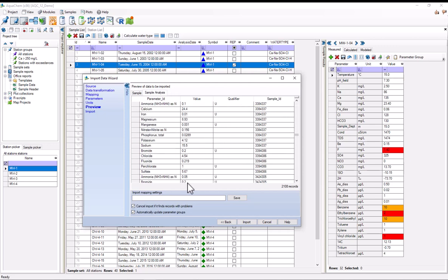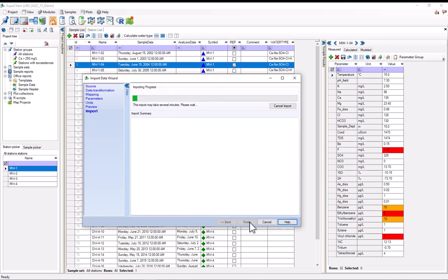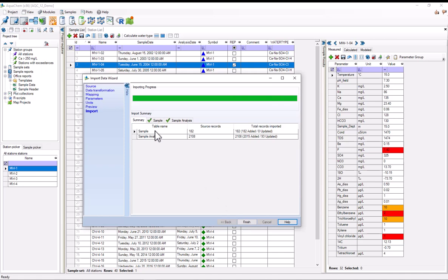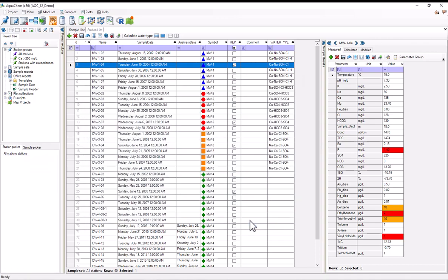If I wanted to, I could save my mapping settings here. So if I'm going to be doing this import many times, I could give this a name and hit save and then use the mappings later. For now, I'll just hit import. And AquaChem tells me that it was able to add 182 samples and 2100 sample analyses. And now I'll hit finish.